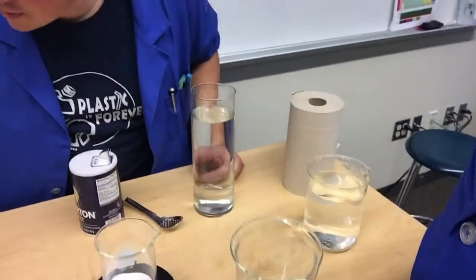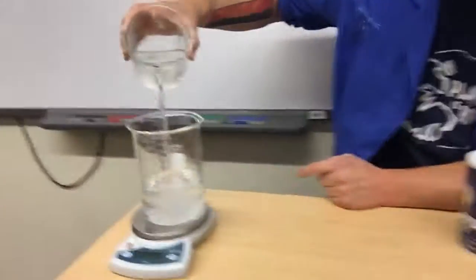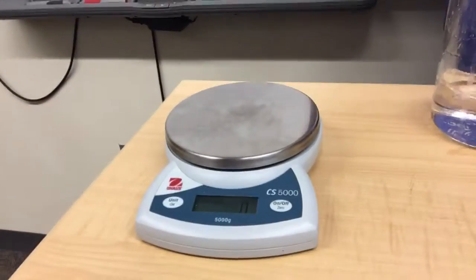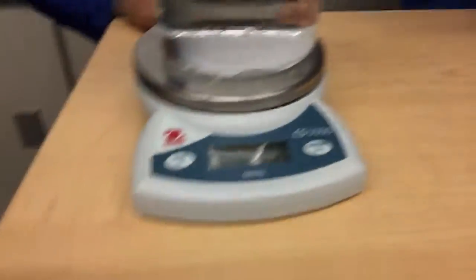And then the other thing we're going to do is get 1,000 grams total with the glass and the water. So there's the beaker. We're going to fill this one up. We did this in class already, and we got to dump a tiny bit. I'm having a tough time getting this accurate. So we got 1,005, plus 51 of this one.